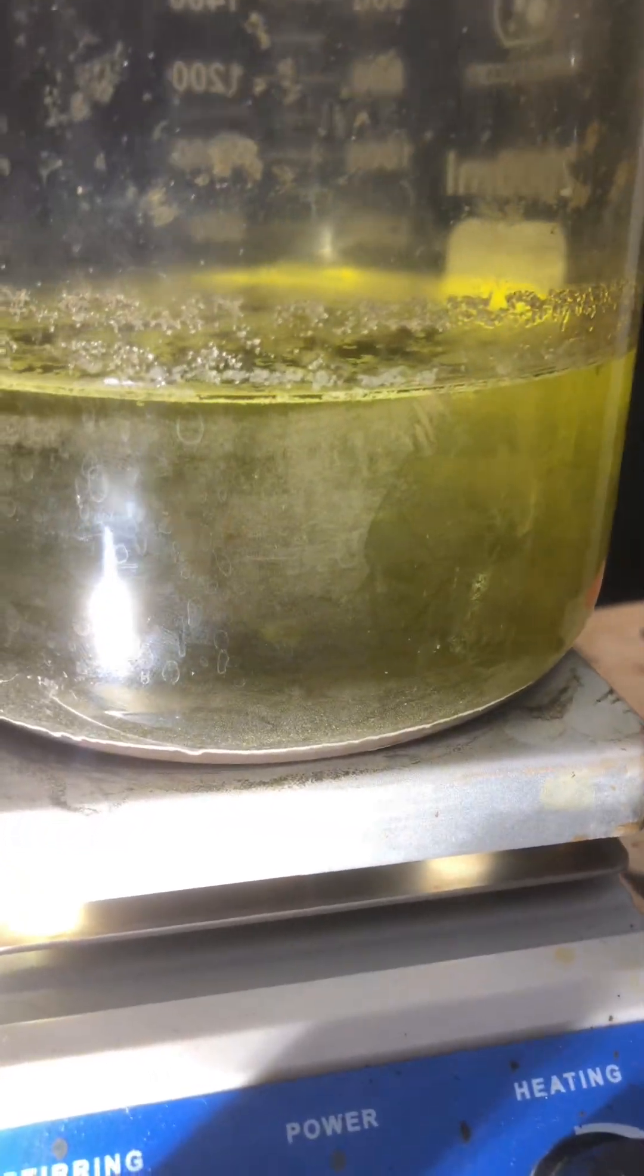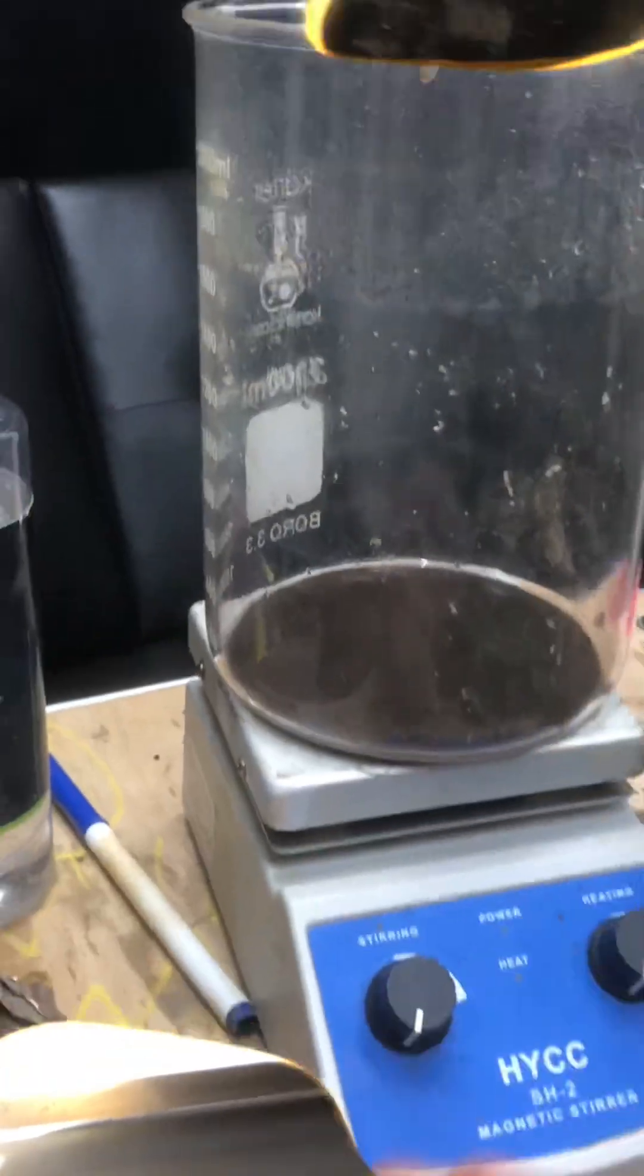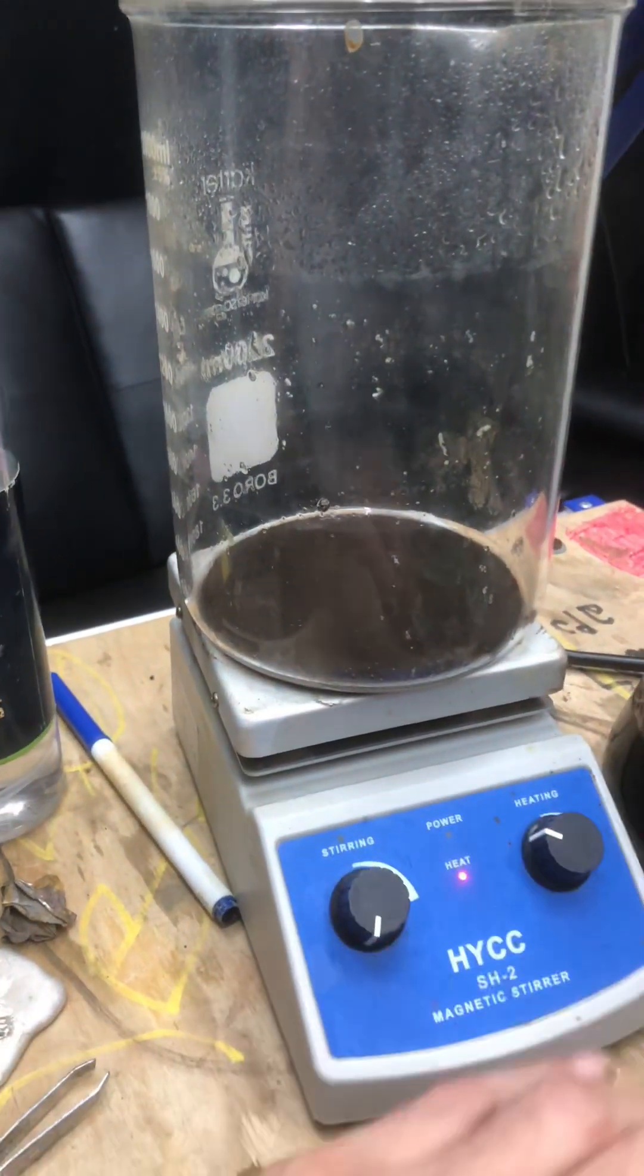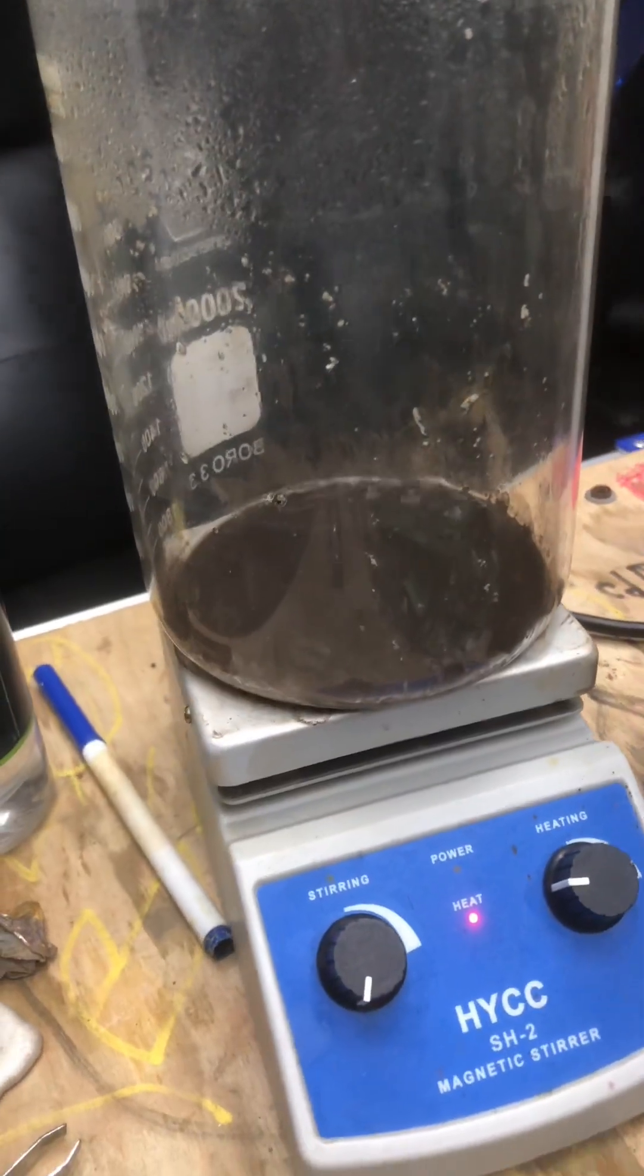Now pour off the excess muriatic acid, rinse with some water, and let your powder sit on the burner to burn off the excess water. The powder will turn into dust in the beaker.